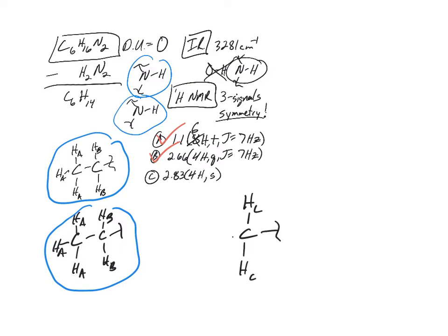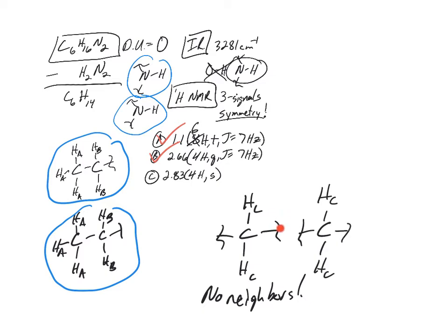And what do we need to say about what's on either side of this carbon? So there's singlets, that means what? No neighbors, right? So we need to write here, no neighbors. Right, because they're singlets. We must have 2 of them, right? The squiggly lines mean I don't know what's bonded there, but I do know it can't be a CH, right? Because otherwise these would have a neighbor. They're singlets. Everybody see that? So we can say, okay, we've accounted for that.